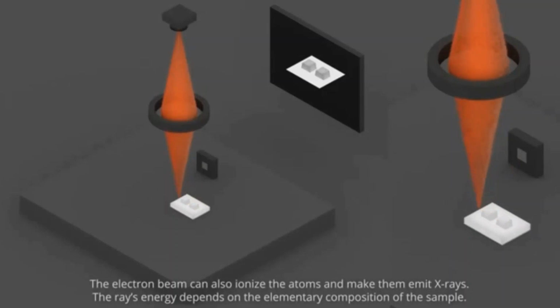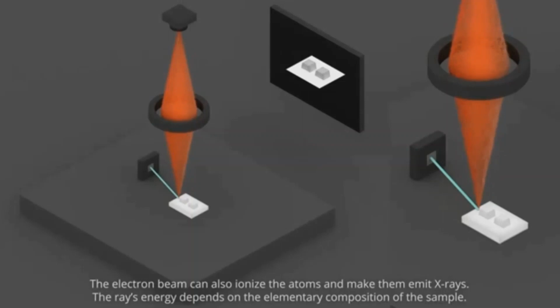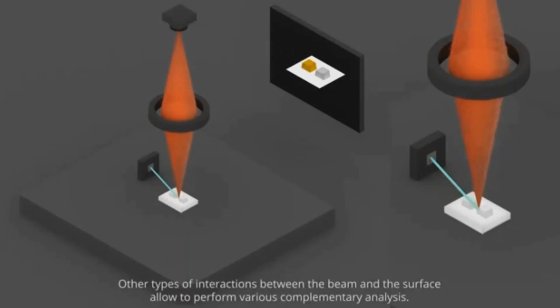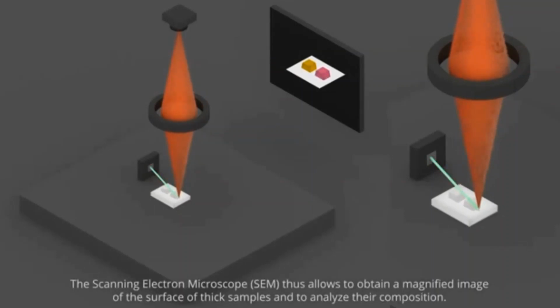By scanning the beam and detecting the variation of the number of emitted electrons, one can constitute the surface topography. The electron beam can also ionize the atoms and make them emit X-rays. The X-ray energy depends on the elementary composition of the sample. By scanning the beam once again and detecting the X-ray energy, one can deduce the chemical nature of the material and its spatial variation. Other types of interaction between the beam and the surface allow various complementary analyses. The scanning electron microscope allows one to obtain a magnified image of the surface of the sample and to analyze its composition.